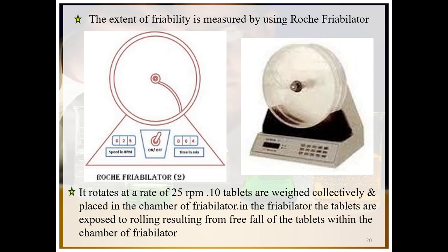Try to remember that according to the USP, IP, and British Pharmacopoeia, a maximum weight loss of not more than 1% is considered acceptable for most tablets. Chewable tablets and effervescent tablets may have different specifications as far as friability is concerned.